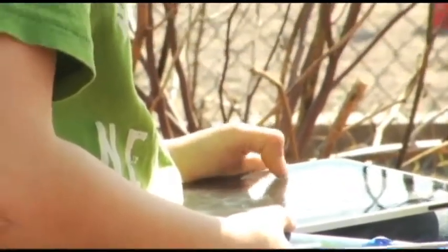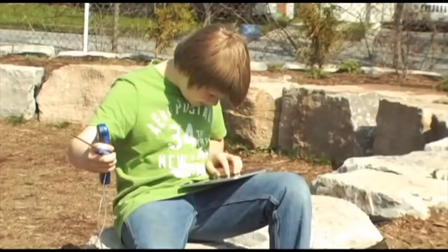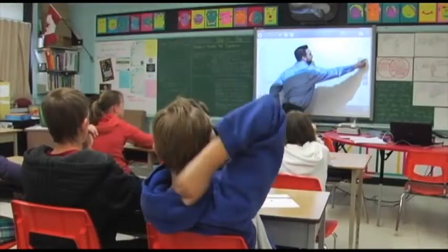Sometimes you can go out into the environment with a Spark unit, collect the data, bring it back, and then show it on a laptop or netbook or even on a desktop, and then have it displayed onto a smart board.